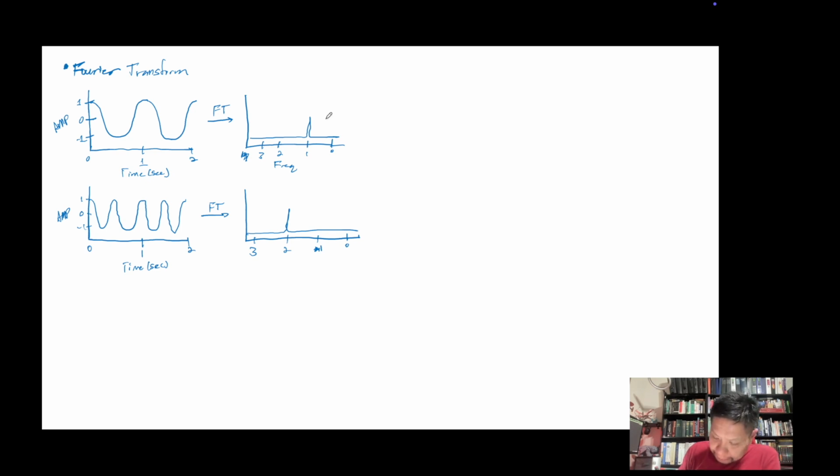So these examples here were just singular protons, a single type of proton. Unless you're doing something like a methyl group by itself, like a methane that just has one type of proton, you're never going to see just one peak like this. It's going to be multiple peaks.